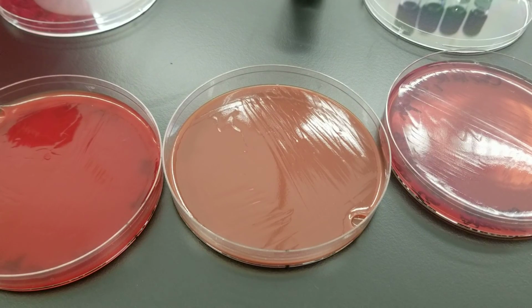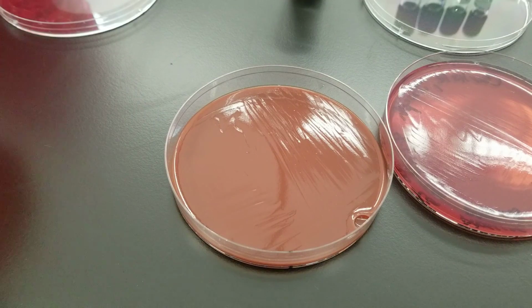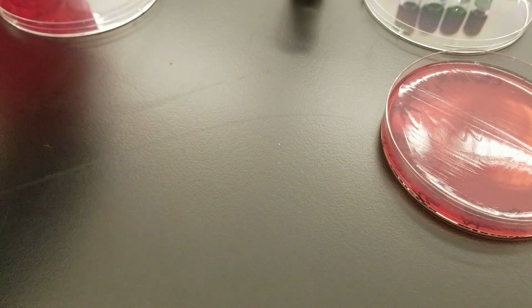So I know what you're thinking. You're looking at this primary setup and thinking, oh my gosh, there isn't any growth. Well, that is because in class we aren't using mixed cultures as specimens. We're just using a pure culture specimen. And so the aerotolerance test isn't actually required in the processes that we're doing in class.